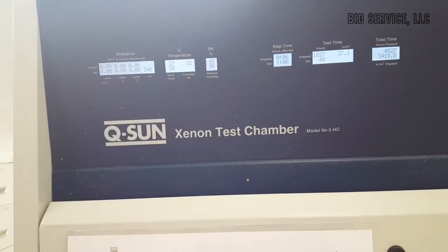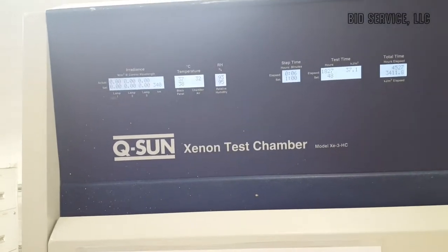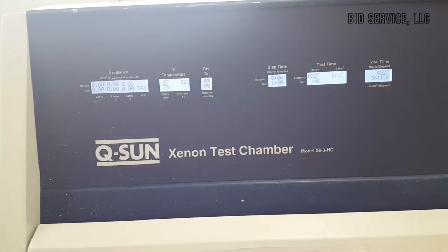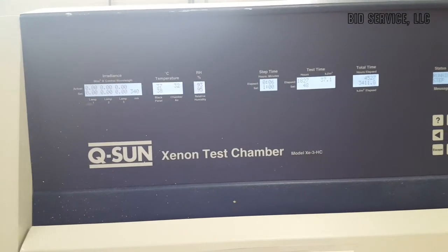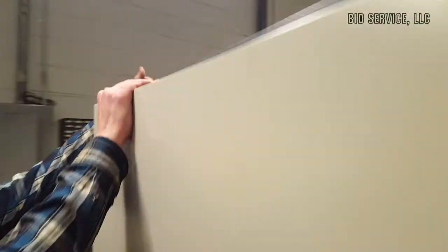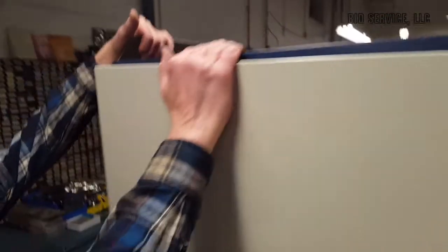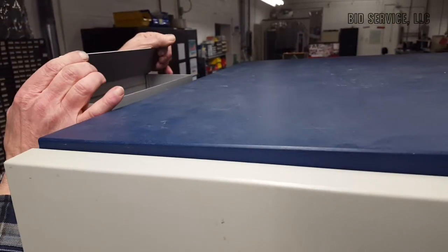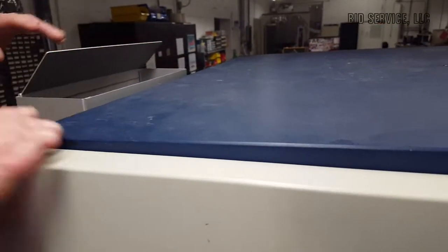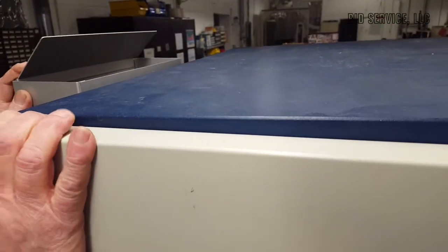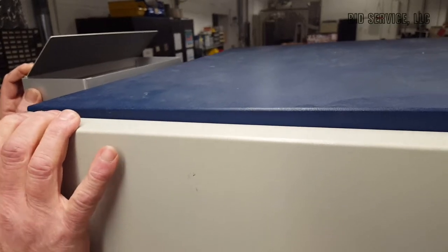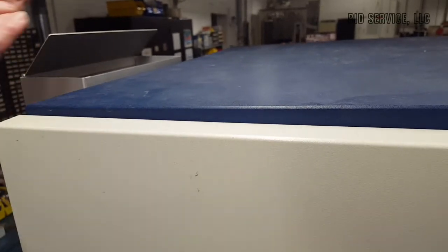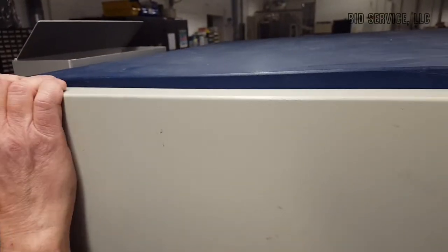Also, for your knowledge, don't be concerned if you see steam coming out of the top of the equipment. This right here is a vent. If you feel over here, this is a vent. And when you really push up the humidity set point, you'll see steam come out of here. That's naturally what it's supposed to do.